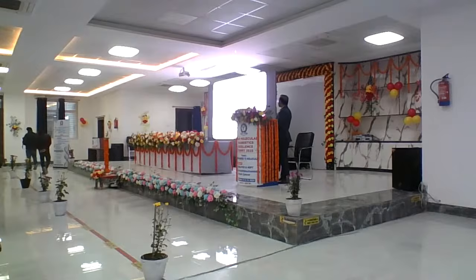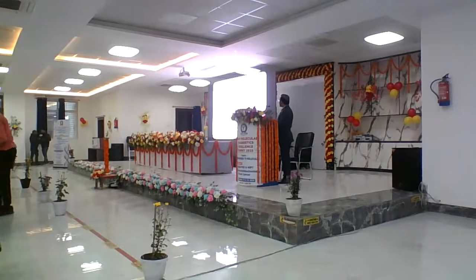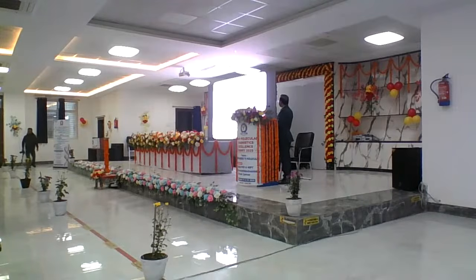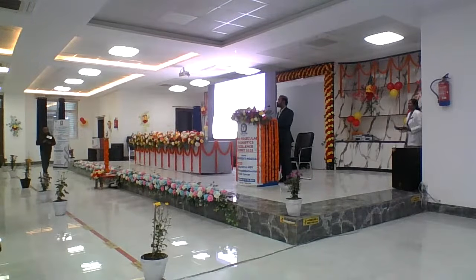So what are the various future directions in ddPCR? We can go for multiplexing, that will be really good. In fact, multiplexing is done, but it should be the main aim. Then ddPCR can be used for POCT platforms, and for various diagnostics in an automated manner. So that's all. Thank you. Thank you for listening. And if you have any questions, please.